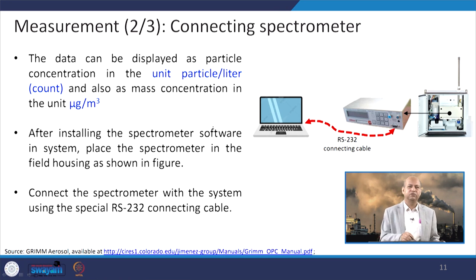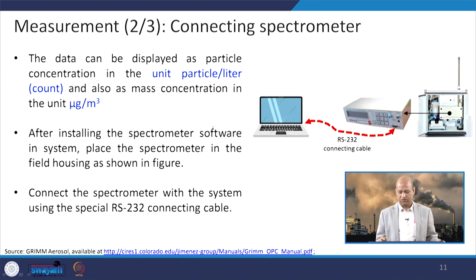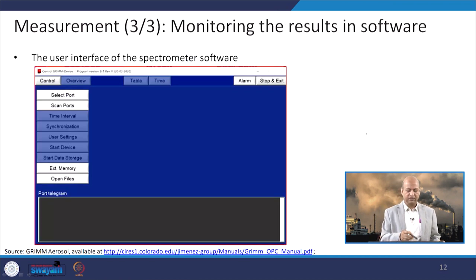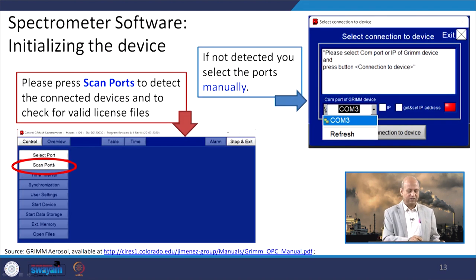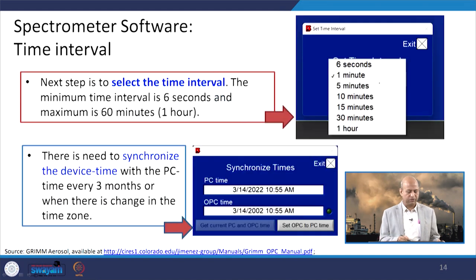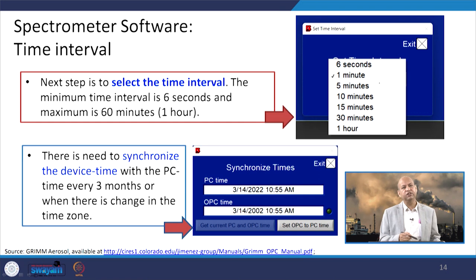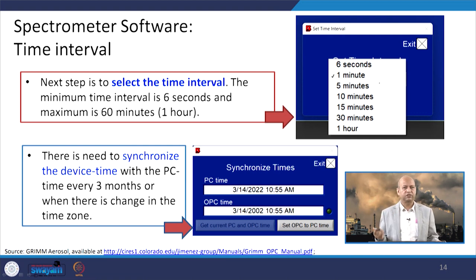When data is transferred to the desktop, it can be in particle count per litre — how many particles are in one litre — or in microgram per cubic meter for mass concentration. The software provided has different options: we can select the port, set the time interval, and start monitoring. The scan ports are selected, and the system can automatically identify which port it is using, or we can manually enter the port name. The time interval can be set from 6 seconds to 1 hour depending on necessity, such as every 5 or 10 minutes.